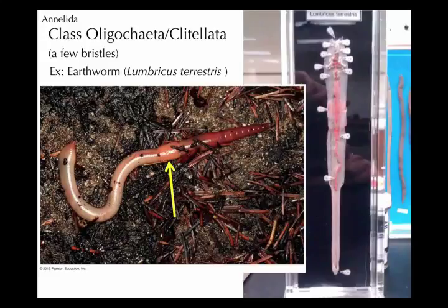There's mucus secretion and sperm deposition from another earthworm, and then the mucus with the sperm in it travels down the body, picks up some eggs, and they're fertilized and drop off the end into these little cocoons of mucus, and then the earthworms develop there. So you can just say that this would be for reproductive purposes.